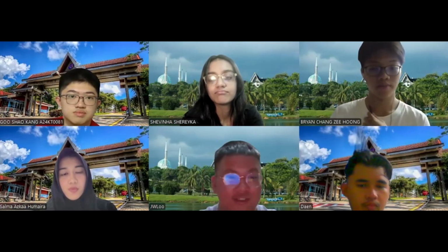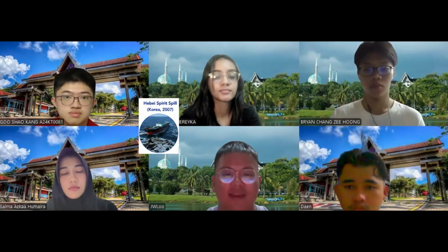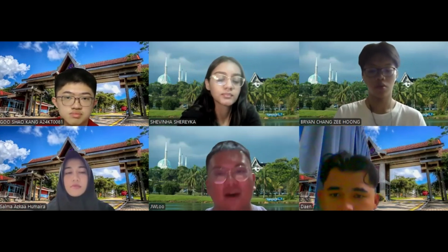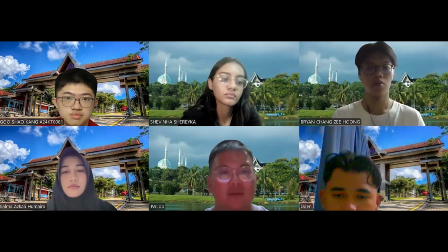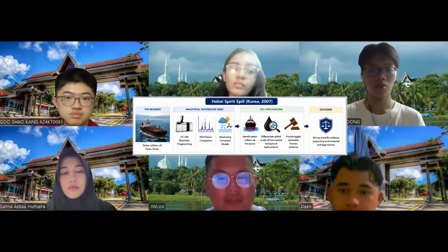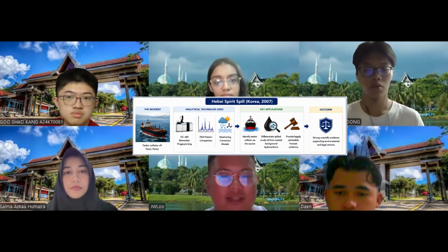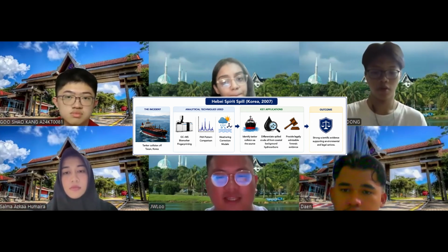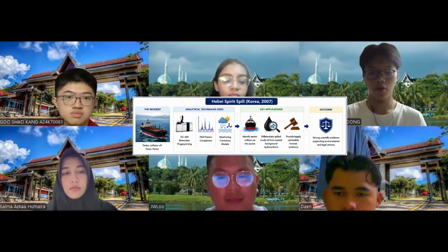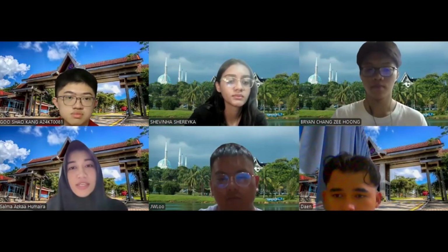Okay, thank you. So just now, Gu and Chef have shared some of the cases that happened before. In addition, the Hebei Spirit spill case, Brazil mystery oil spill, and also Sarnia oil spill case have highlighted how fingerprinting supports both environmental monitoring and regulatory enforcement. In the Hebei Spirit case, GC-MS biomarker fingerprinting, PAH pattern comparison, and weathering correction models were used to identify the tanker collision as the source, differentiate spilled crude oil from coastal background hydrocarbons, and also provide legally admissible forensic evidence.